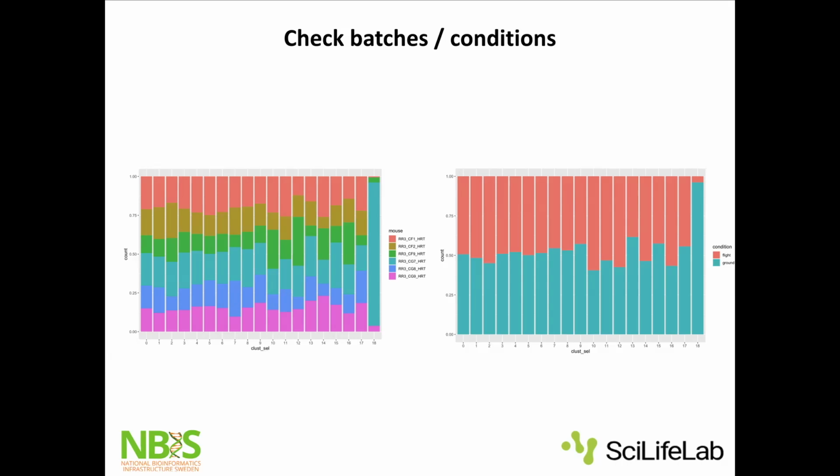Yeah, but my question is more like, sure, if the difference is not biological, if it's some technical artifact or something like that, then I understand. I think removing it would be good, but even if it's biological, my question is, what kind of information would we get from this specific tissue that we've extracted from a person, where we can see that the population is mainly comprised of one cell type?